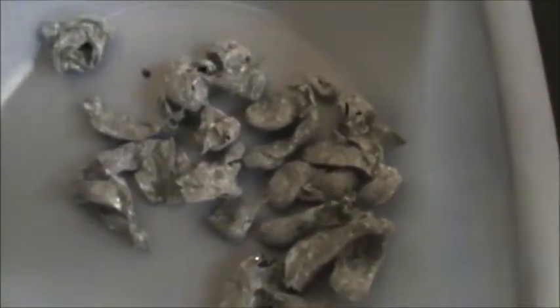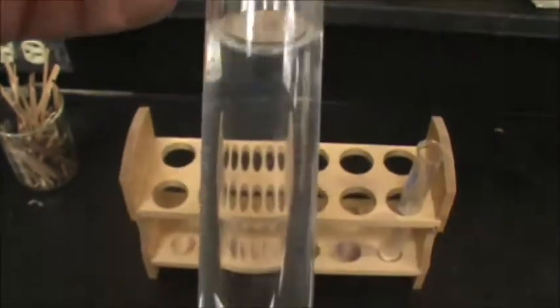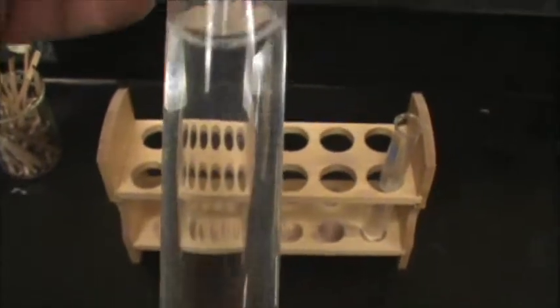That's zinc right here. As you can see, the zinc, it's solid. It's pretty dull in appearance because it's oxidized slightly. But that is the metal right there. It's all gnarly looking, but it is solid at room temperature. Here is my hydrochloric acid sitting in a test tube. As you can see, it looks very much like water.